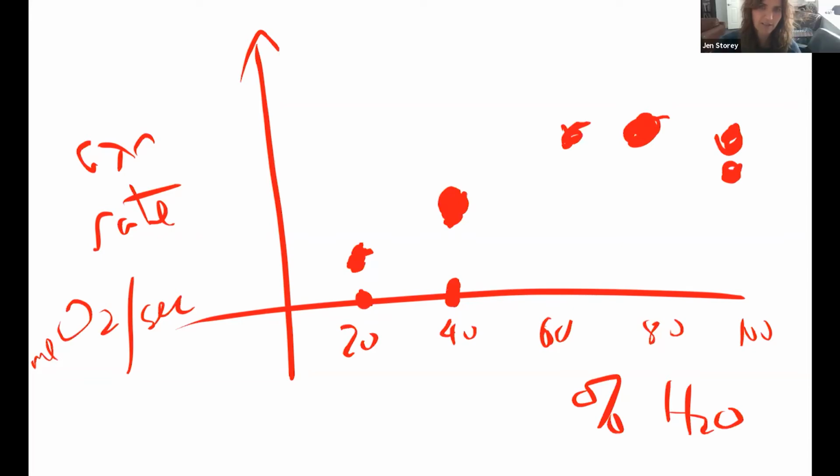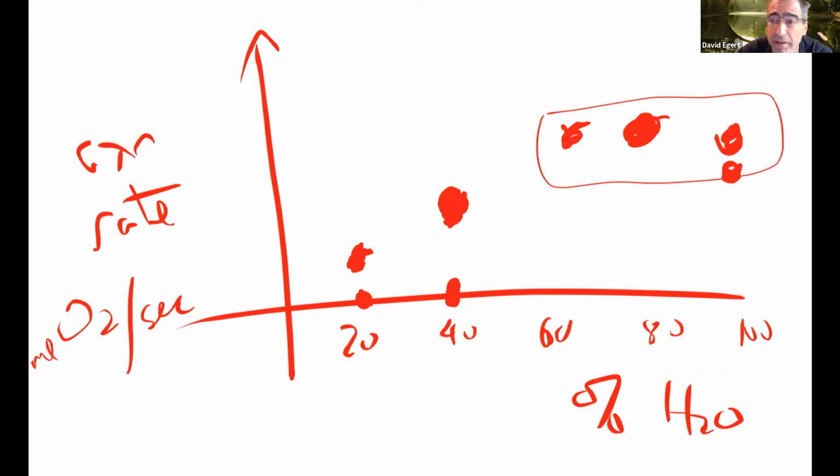Yeah, I was expecting the last two to stay the same. I was kind of surprised, because I thought maybe it had reached saturation or something. I mean, if these are not increasing anymore, what's probably happened? You said saturation, yeah. The evidence that we've hit saturation is that it's not getting faster. If something goes down a bit like that, I would say it's probably just the noise.